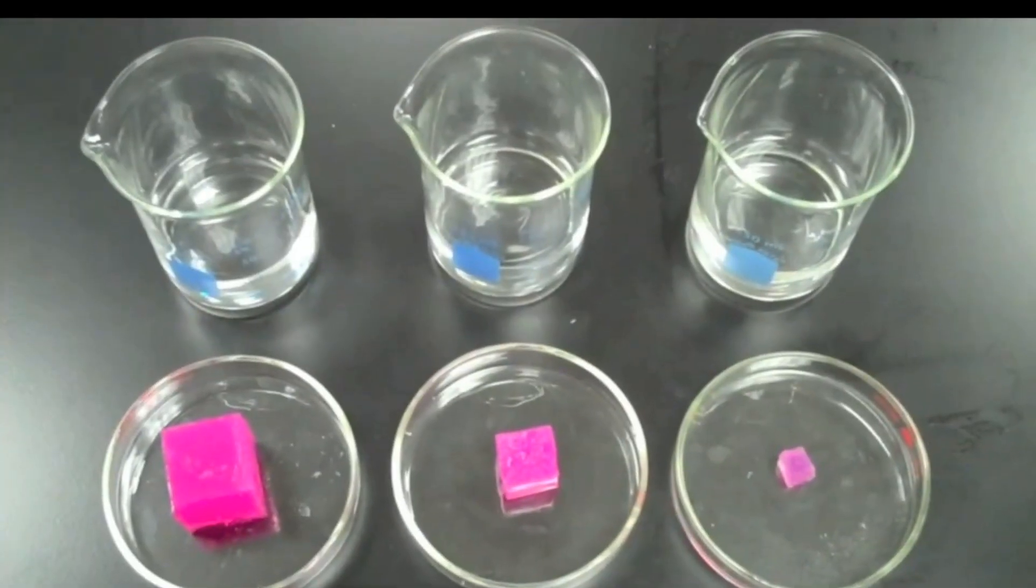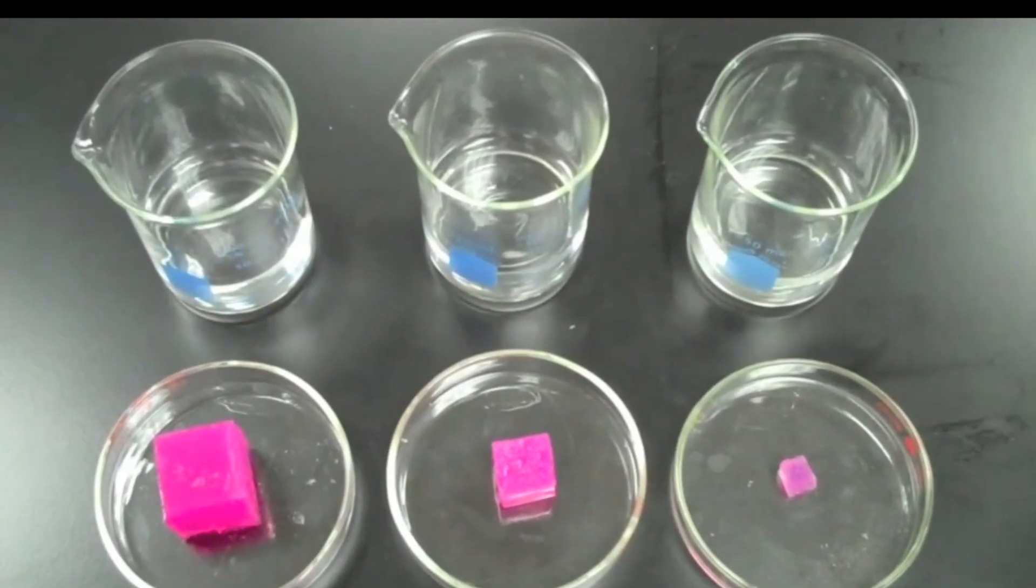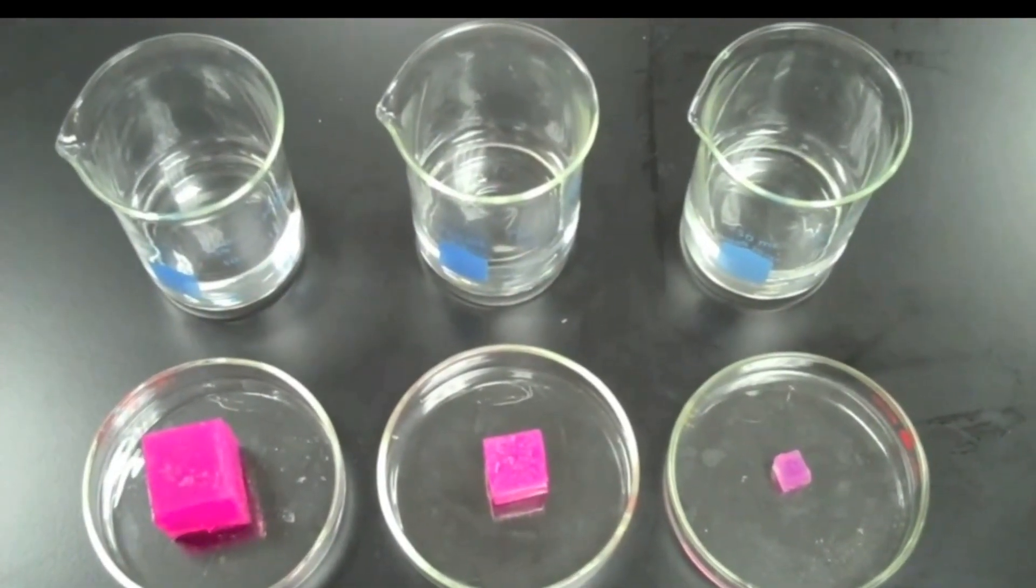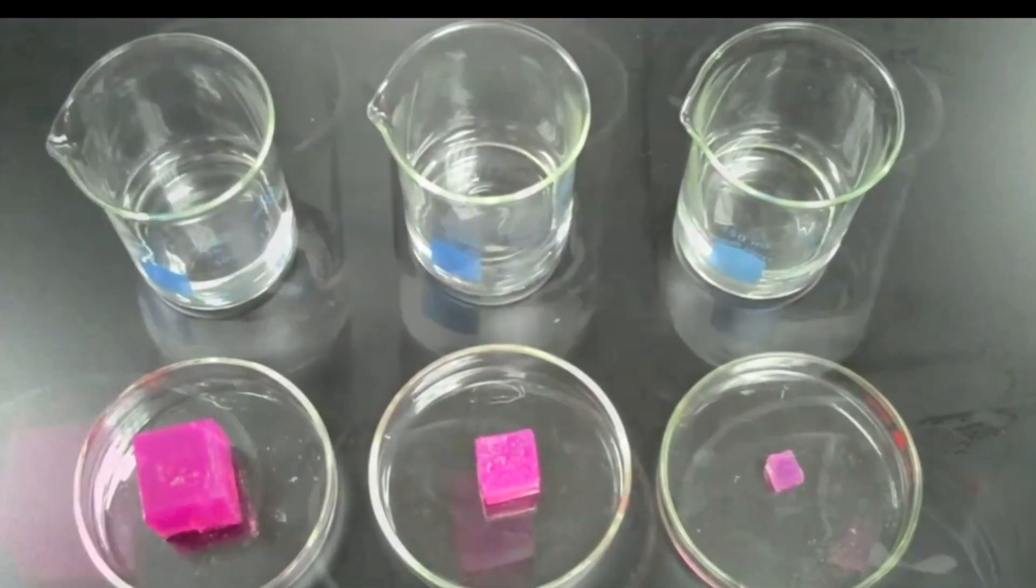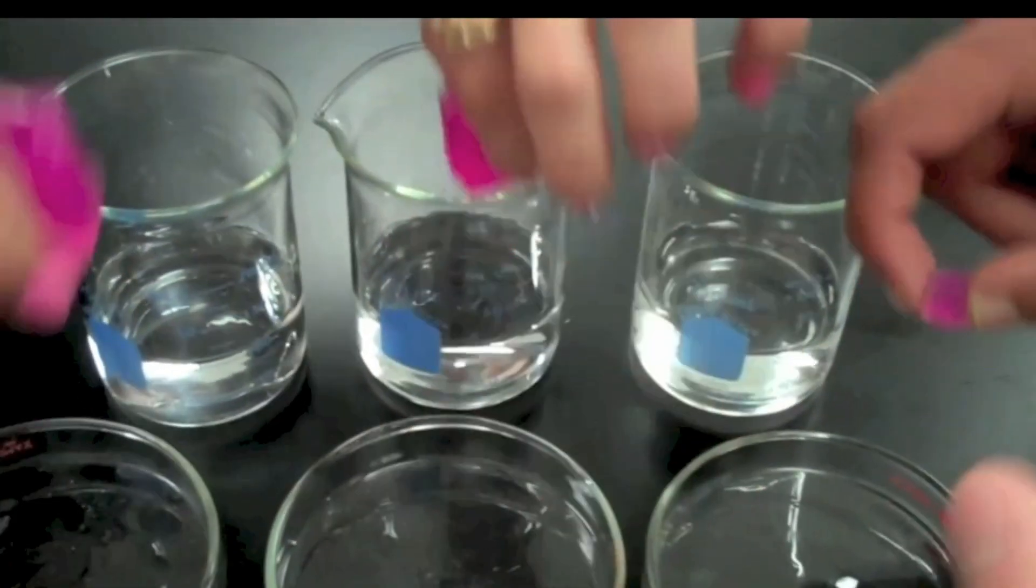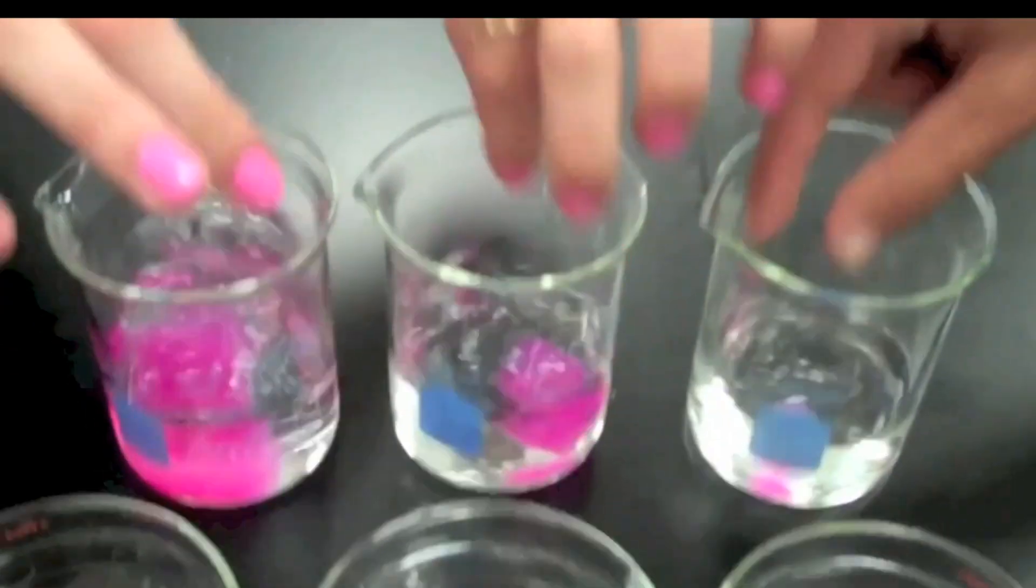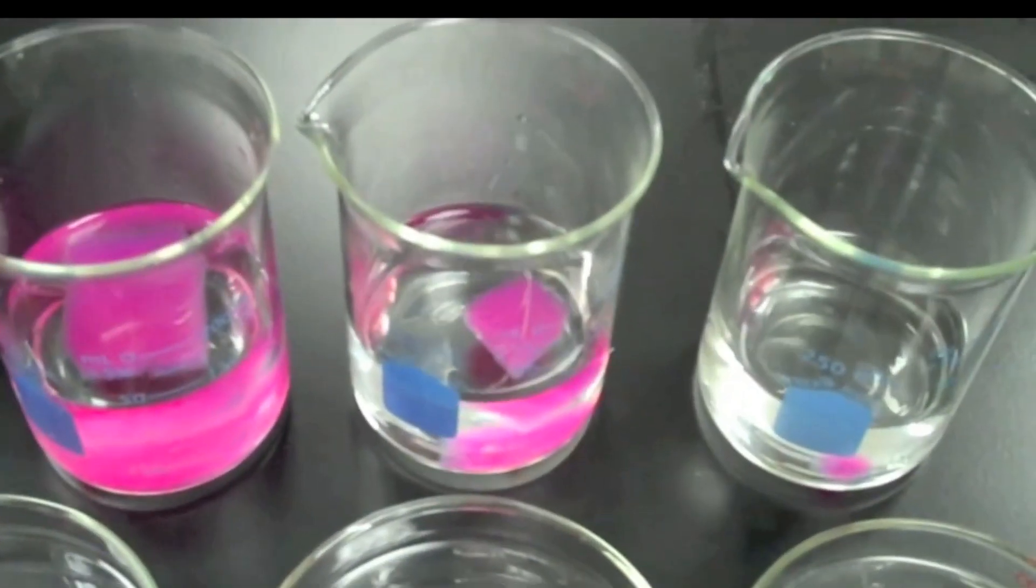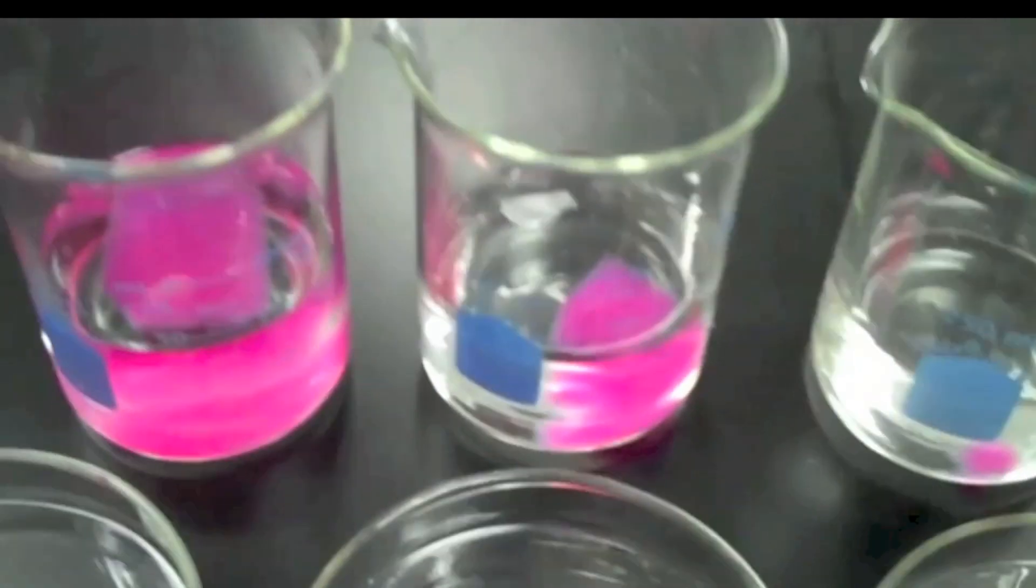Exchange of materials across the cell membrane often occurs through the process of diffusion, where dissolved molecules move from areas of high concentration to areas of low concentration. When the cubes are placed in the hydrochloric acid, the acid representing the raw materials will diffuse into the cubes, turning the indicator clear.